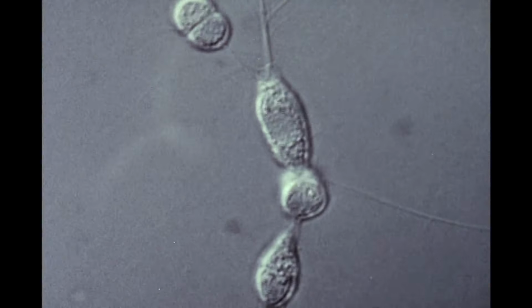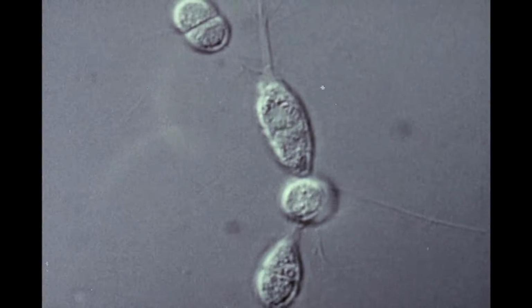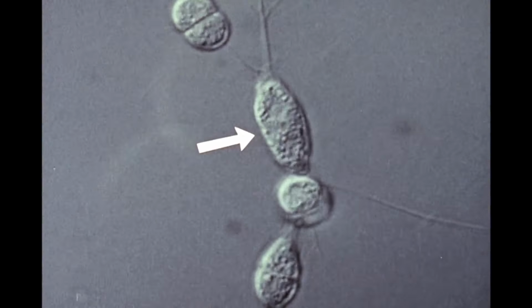Nuclear and cell divisions are frequent. Some of these cells have recently divided, and this one is about to divide.